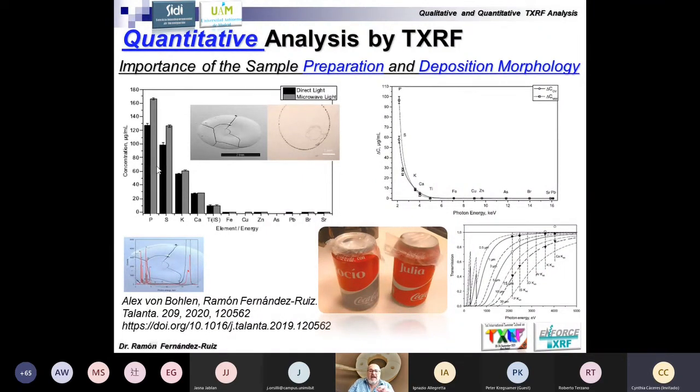And now the same sample after high pressure and high temperature microwave digestion. We break completely all the sugar, and then we obtain a very thin film of the metals present, and we now obtain these results for the same elements and for the same compounds.